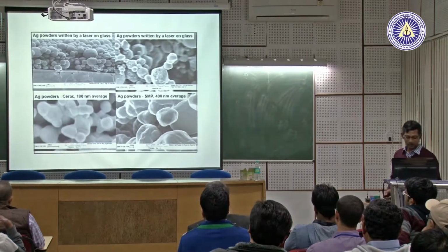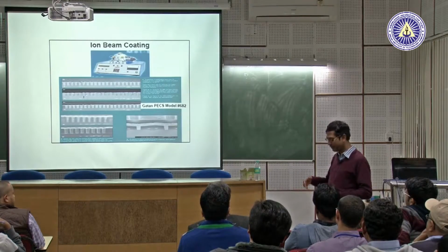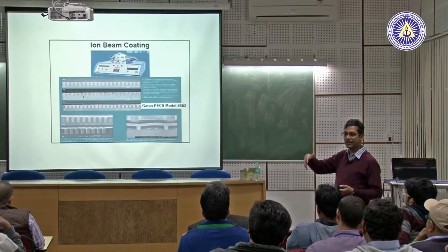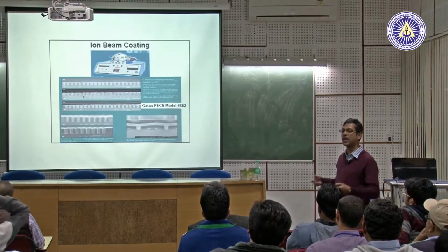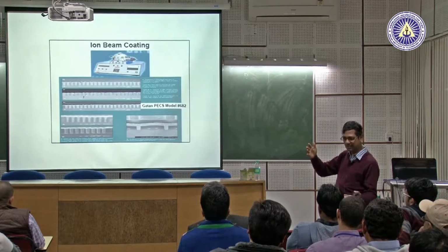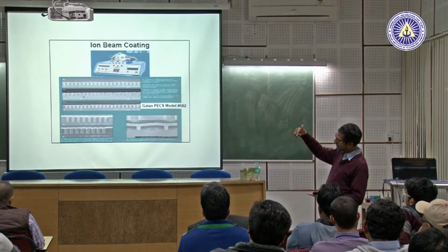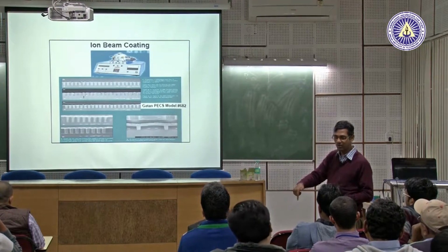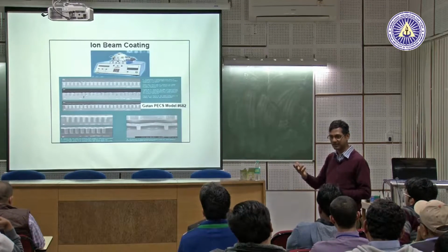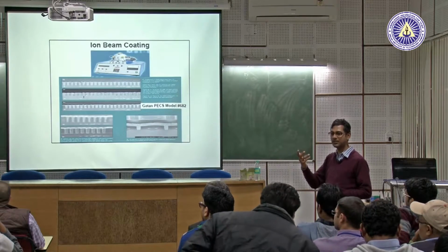How is this sputtering? This is a sputter coater. Sputtering is nothing but you have a gold palladium source and you have argon ions. You have seen, no, they put argon gas inside it, and if you apply a large voltage, not large, 3 to 4 kilovolts, so argon ions will be energized, and then they will hit this source on which you want to deposit thin films. So simply by sputtering, which is a physical vapor deposition process, this will sputter the gold palladium.